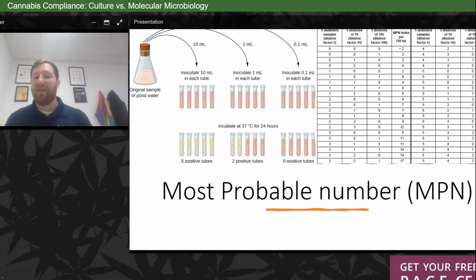Also on the market, there is most probable number analysis. It's a different kind of approach to a culture-based method of analysis. In food and environmental, we actually conduct these, or I should say we used to conduct these with test tubes, and you still could and abide by FDA and EPA methods of analysis. But through differing dilutions and the number of tubes that show positive, you can then indicate what level of contaminant is there.